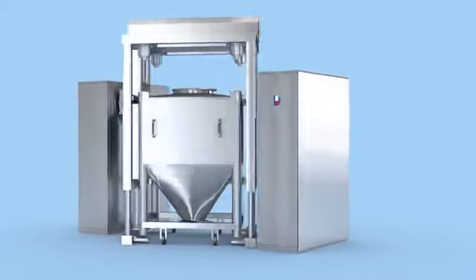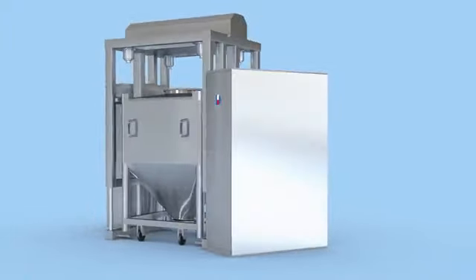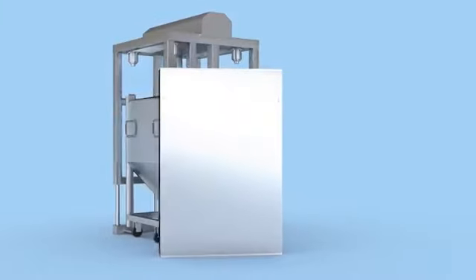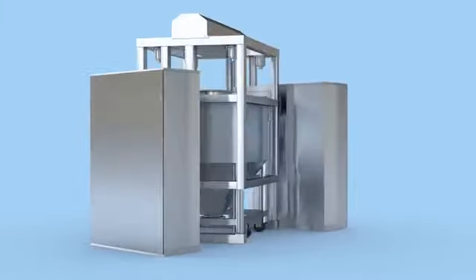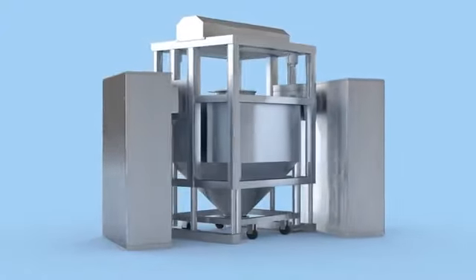Hopper Mixer can meet the mixing requirement of large batch and multi-product. It is widely applied in such industries as pharmaceutical, foodstuff, chemical, dairy, etc.